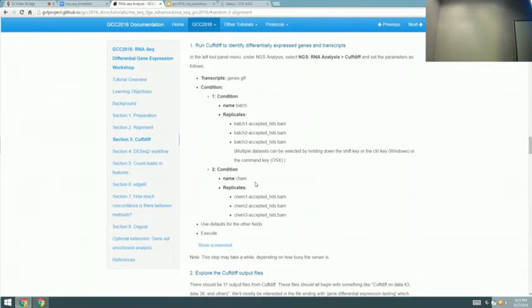So basically, you need overlay, right? We look at the transcript, we look for sections of the DNA, and so our reading from the transcript. When we align back to the DNA, what's happening is being able to look here and say, all right, only 20% of my reading maps, or 80% of the reading maps here, 20% that doesn't. I'm going to leave it out. Whereas what should happen is that the region is split, 20% map here, 80% map here. So the gap is there.